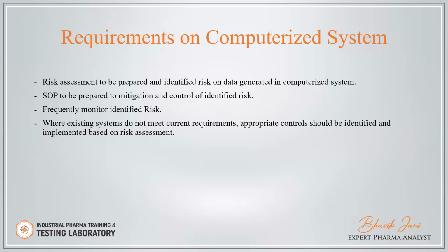Where the existing system does not meet the current requirement, appropriate controls should be identified and implemented based on the risk assessment. You have to prepare the risk assessment, and based on the risk assessment, you have to review your system.